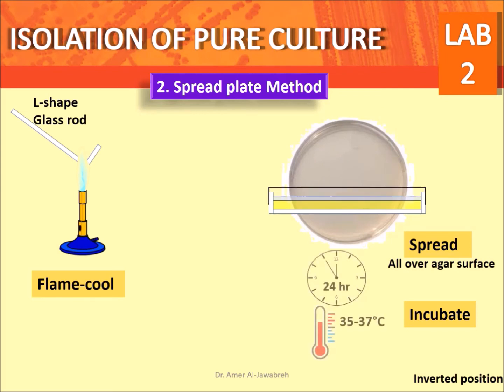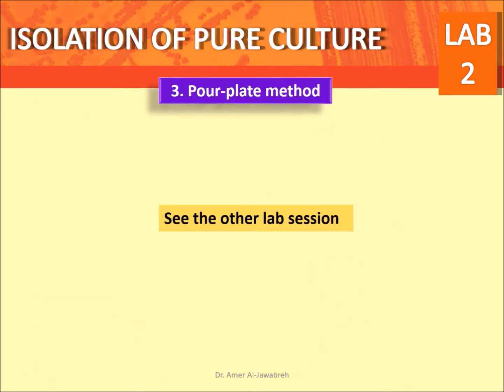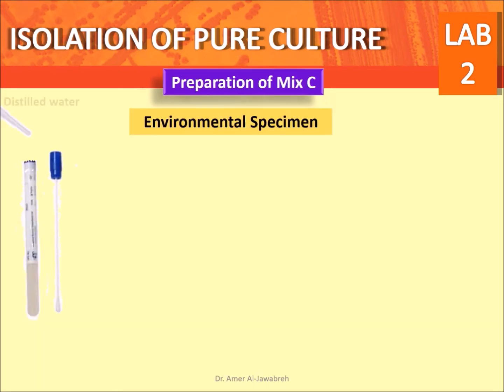Incubate in an inverted position at 37 degrees centigrade for 24 hours. Spinning turntables can be used to make a uniform spread. Third, pour plate method. See the other lab session. To prepare the mixed sample on the day of the experiment, add 1 ml of sterile water into a sterile swab tube and allow to soak for 5 minutes.